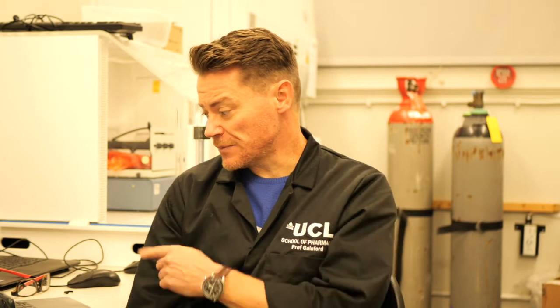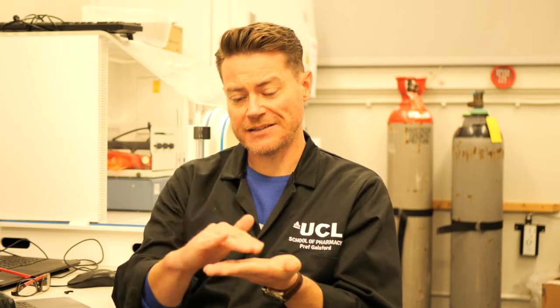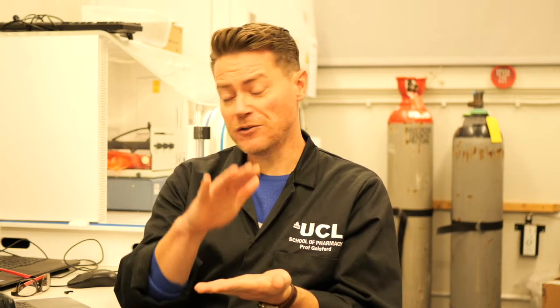Again, there are physical limits on the angle that you can achieve with a typical lens. So on the right-hand side of that slide, you can see three different lenses, and the numerical apertures are the maximum that can be achieved: 0.12, 0.34, 0.87 in this case. N is the refractive index of the medium through which the light is passing. So normally that would be air. You'd have your slide underneath the lens, and then between the slide sample and the lens is air. And so normally N you're not changing because it will be the refractive index of air.